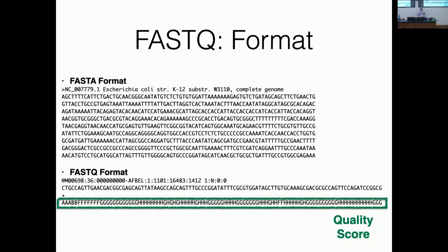I don't have it memorized, but it's something you look up if you care. So for every base, you have an estimate of how accurate the base call is. Makes sense? Questions about that?